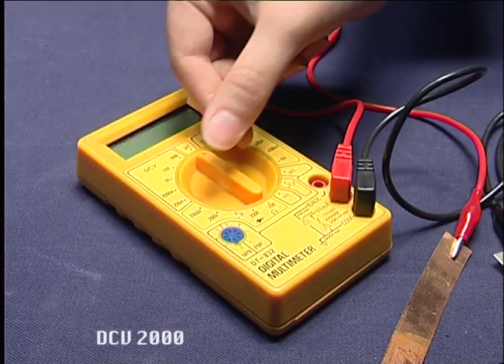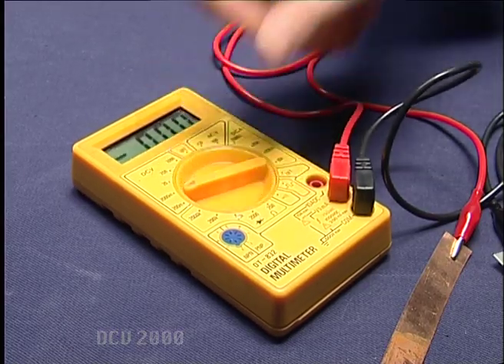To measure the voltage, DCV2000 condition is used in multimeter.